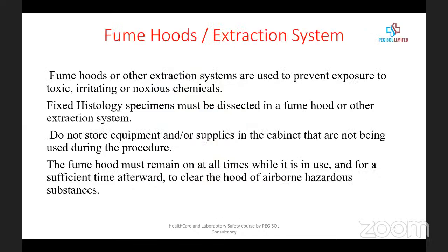Look at fume hoods and extraction systems. So fume hoods or other extraction systems are used to prevent exposure to toxic, irritating, or noxious chemicals.